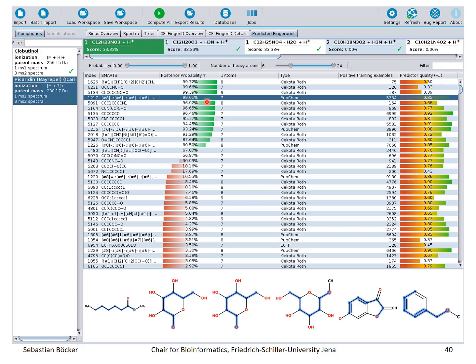But what we also tell you is how well this particular predictor, this property, was predicted in cross-validation. The higher this number, this quality estimate, the better. It might now be no longer F1, but MCC, the Matthews correlation coefficient, but they both measure the quality that we achieved in cross-validation. The closer this is to 1, the higher was the power of this predictor in cross-validation. Now a predictor which is not performing very well in cross-validation can nevertheless be very, very sure, and that's just the math behind it.